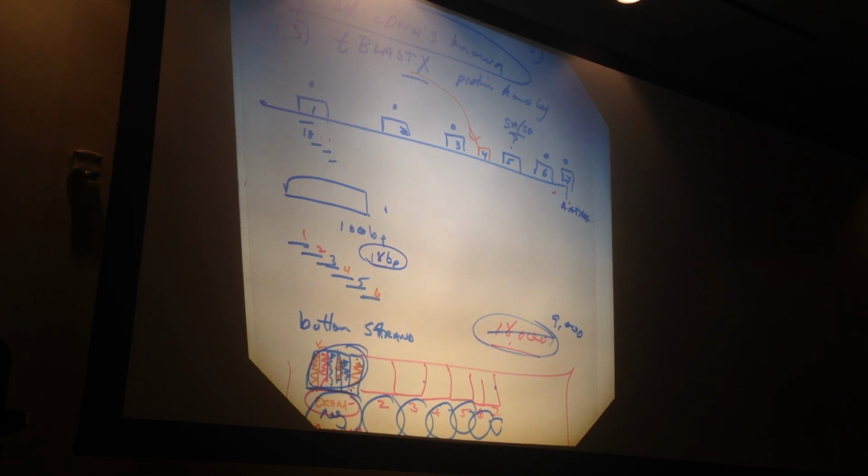Whatever, 100,000 oligos they'll make. So we have the cDNA and we're splitting it up. These are synthesized nucleotide oligos. Oligos are generated by an oligosynthesizer. You have a column, you add a base, you add another base, you add another base. These are synthesized in the laboratory, these oligos. They're not cut from anywhere. They're derived from many places.